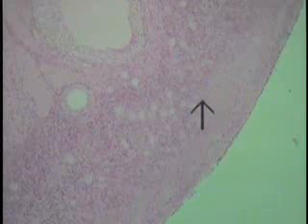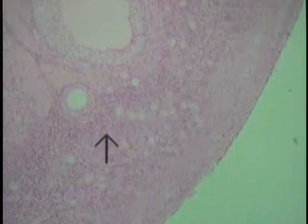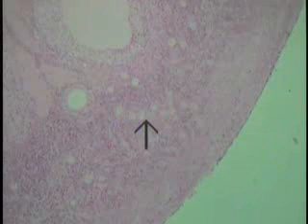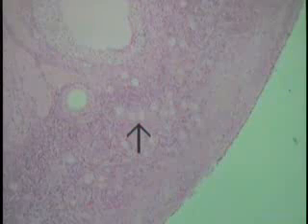If one proceeds into the cortical region of the ovary, a narrow band of cells can be found. These are the ova. The ova are these extraordinarily large spherical cells as indicated at the tip of the pointer. Go down and examine these particular large cells in detail at higher magnification. These large spherical structures here are individual cells, one being located at the tip of the pointer, another located here, another here, another there, and so on and so forth.